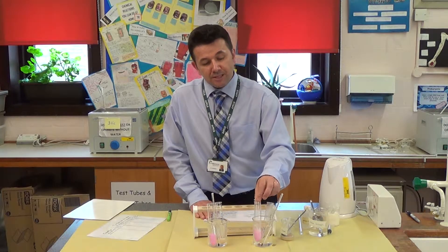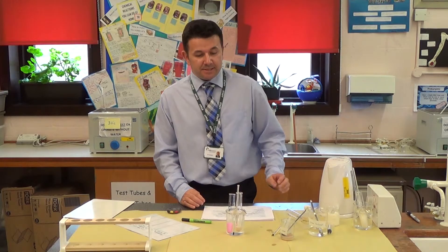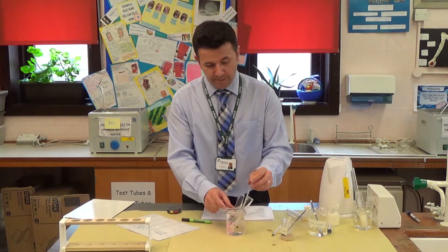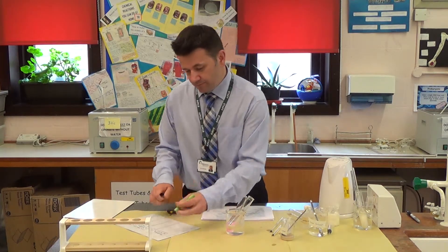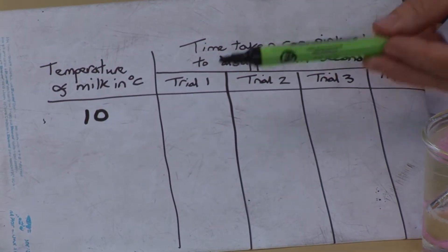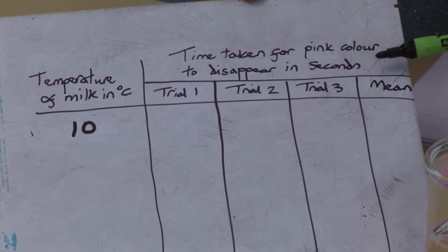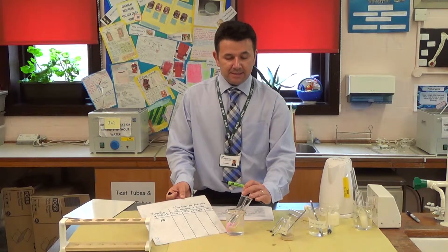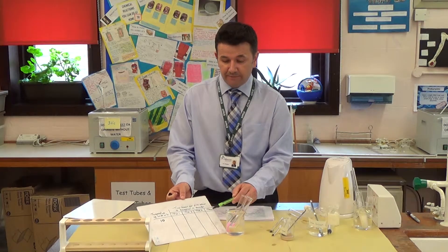We will be measuring the time it takes for the solution to go colourless. It's now been a few minutes, so we've allowed the temperature in the test tube to equalise with the water bath. The temperature here is 10 degrees C, so I'll note that on my results table. I'm going to add the tubes together and time how long it takes for the pink colour to disappear in seconds. I'm going to do this three times — you would set up three sets of tubes, repeat the experiment three times, and find a mean value.